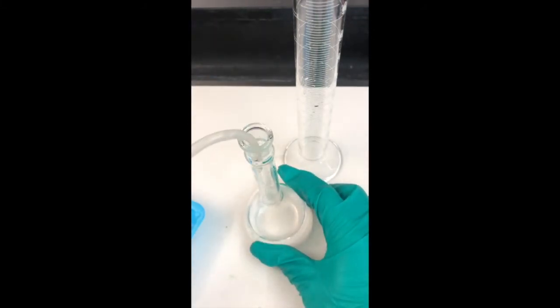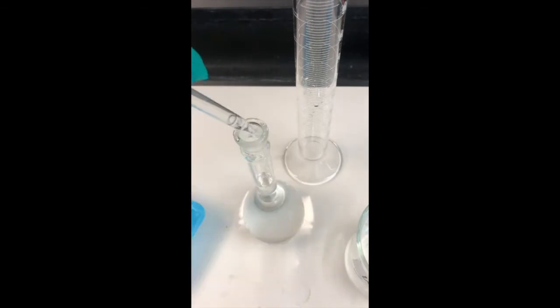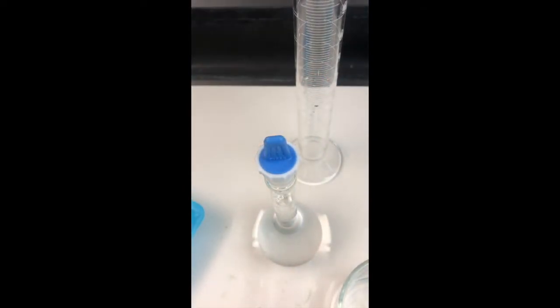Fill to the neck of the flask with your wash bottle. And you're going to want to top off with an eyedropper until the level of the solution reaches the graduation mark on your flask. Make sure to get eye level so you can see the meniscus. You're going to cap, and you're going to want to mix your solution, because the denser sugar solution that you've put in is going to be resting on the bottom. Inverting with the cap on will ensure that your solution is thoroughly mixed and ready to be used as a stock.